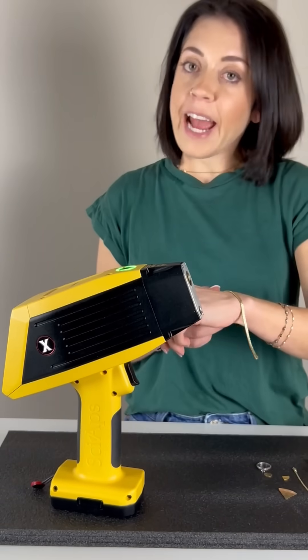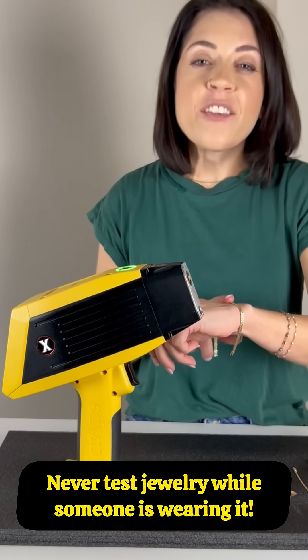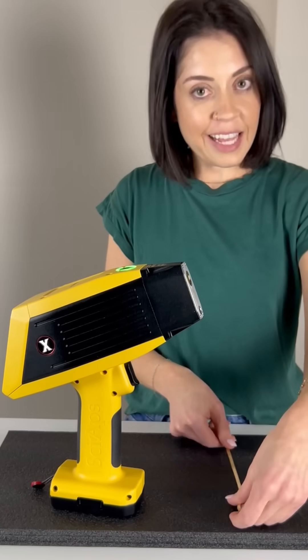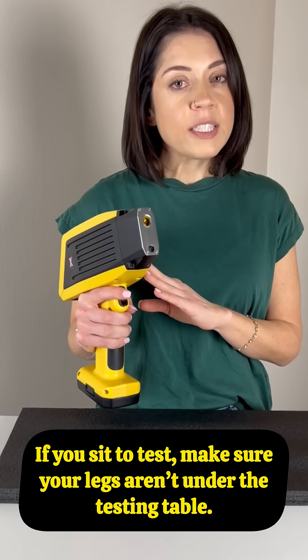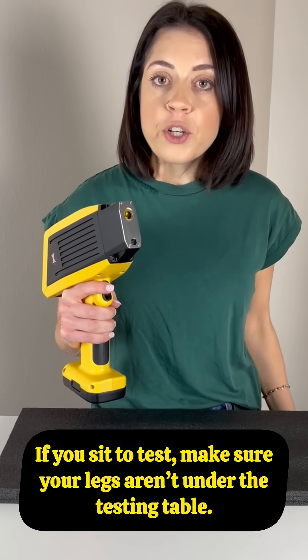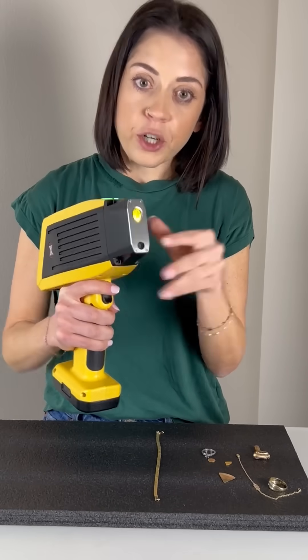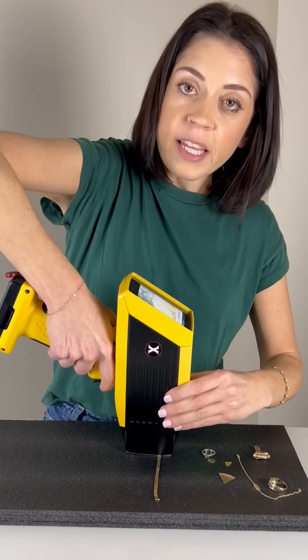To make sure you're getting an accurate test and testing safely, follow these steps. Never test jewelry while someone's wearing it. Remove the jewelry and lay it on the platform. I prefer to stand when I'm testing but if you prefer to sit, that's okay too. Just make sure your legs are not underneath the testing table. Have the nose of the tester touch the piece and make sure you line it up with the camera.